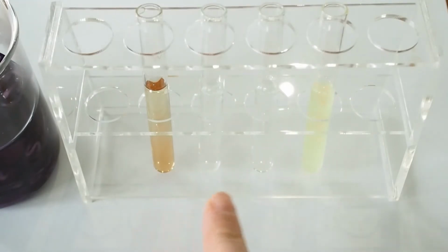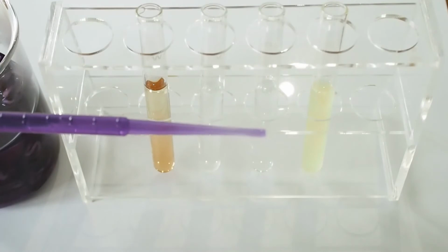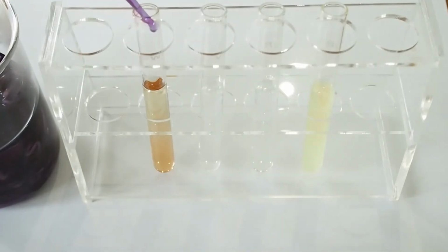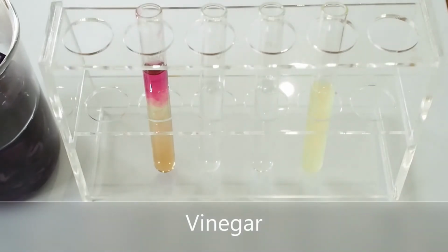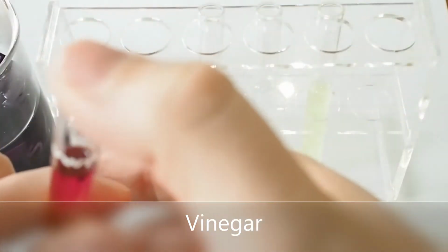Now only one of these is water. Now I know you could probably guess 2 of them aren't water by looking at them, but let's see what happens when we add this indicator. Look at that lovely purple to them. So this first one, let's add a fair amount. Ooh. And we'll give it a little shake. I'm just going to put my thumb over.